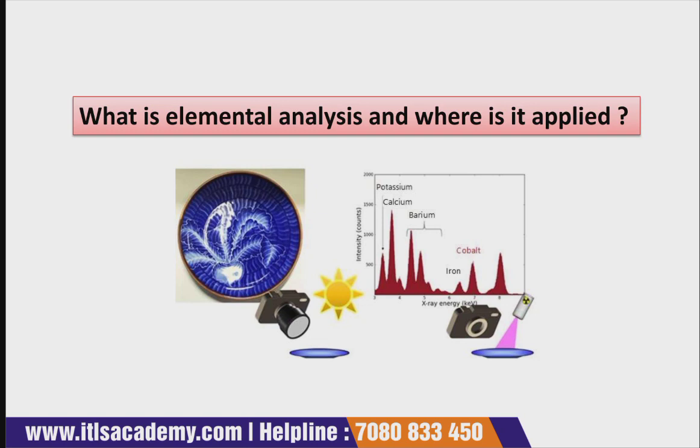of interest. For example, some basic techniques that are used are X-ray fluorescence, atomic absorption spectroscopy, and inductively coupled plasma, ICP optical emission spectroscopy. All these techniques we have studied so far, isn't it?